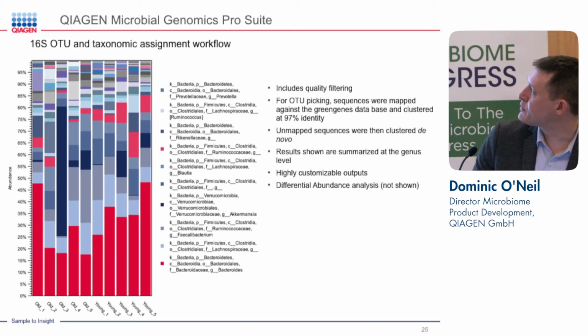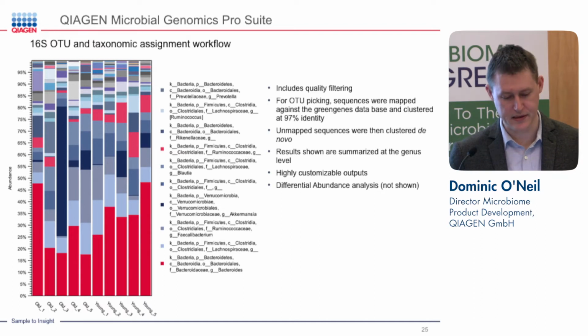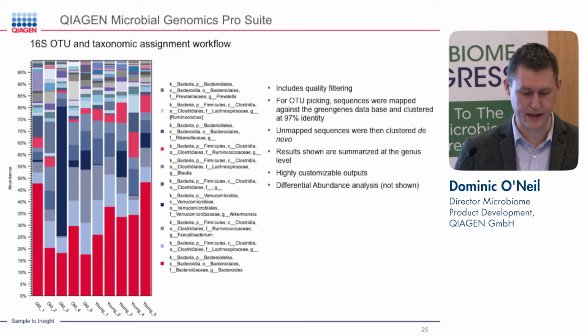Overall, based off of the number of small amounts up here, perhaps there's an indication that there's a little bit more diversity in the young samples rather than the old samples. You can see that more clearly on a later slide. I think it's a little bit difficult to read out of here.